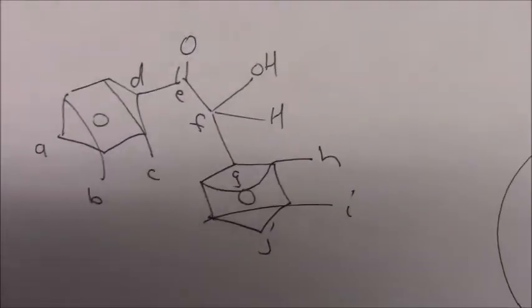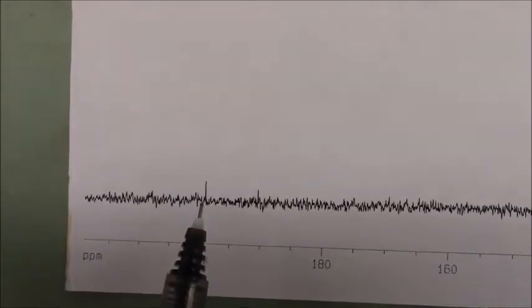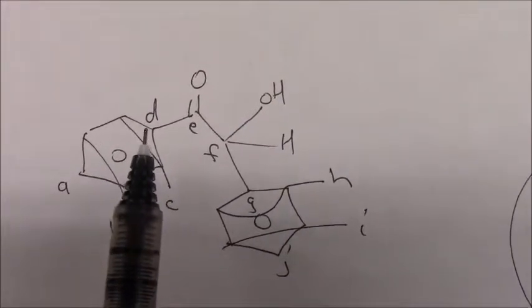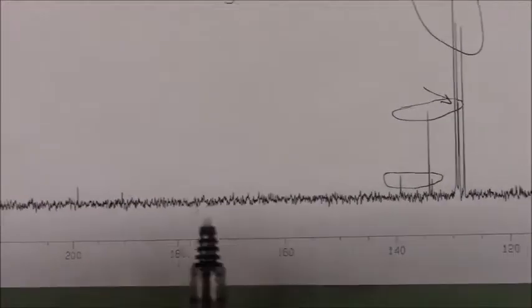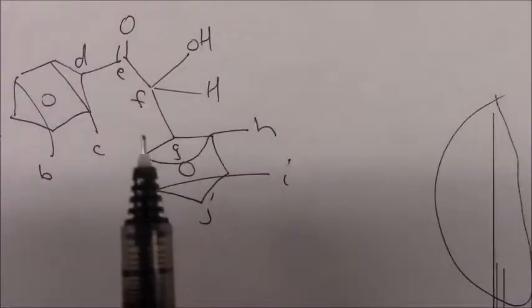That's the proton NMR of your starting material. Now the carbon-13. Obviously, E would be furthest to the left, that little spiky thing. And any of your carbons that have no hydrogens on them, such as D and G, will be just as short and stubby as E was. So there was your carbonyl at 190-something. You're going to see 2 right there, so that would be what I called D and G.